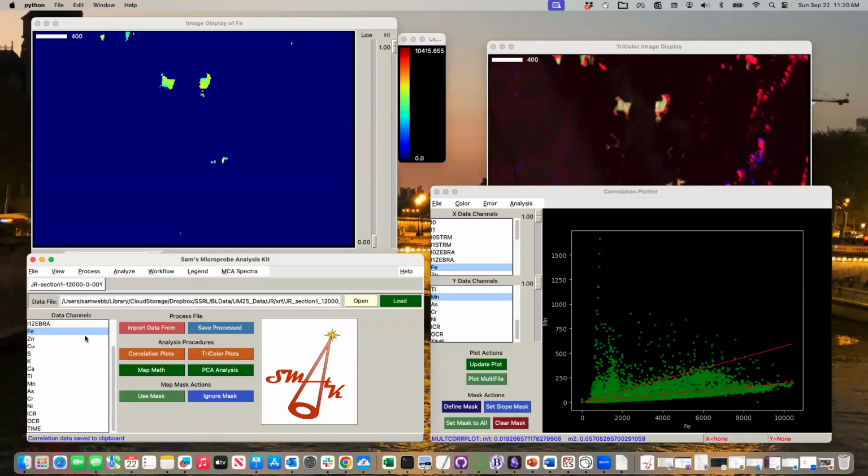Again, it's hard for it to actually regress this particular line here because there's only 5 or 6 points in it. But it's going to try to balance as many regressions as you could. You might add like 4 or 5 regressions and try to figure all the little different slopes you might have in the data set. Some of you will find data sets where you have fingers of data that come out like that. And then you can try to fit all those together in one big batch rather than try to highlight them. It's probably better to highlight them, but this was before that was on there. So that gives you both slopes in this case.